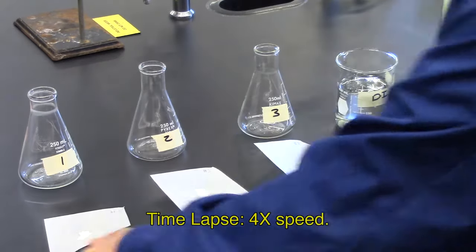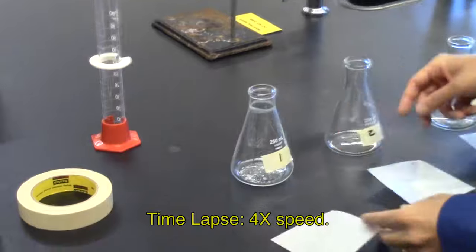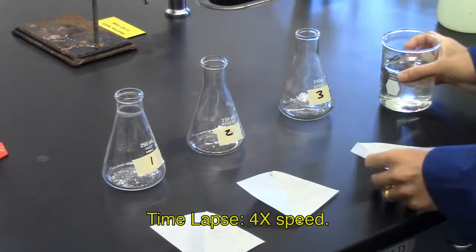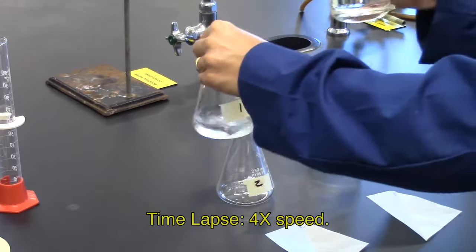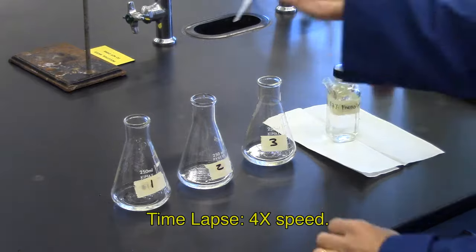Next, label 3 250 ml or 125 ml Erlenmeyer flasks and transfer each sulfamic acid sample to the appropriate labeled flask. To each flask, add approximately 25 ml of distilled water and 2 to 3 drops of phenolphthalein.